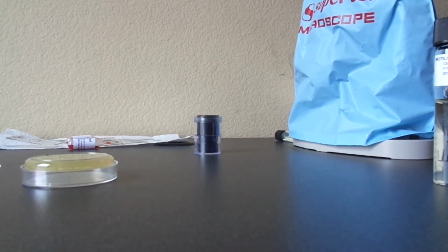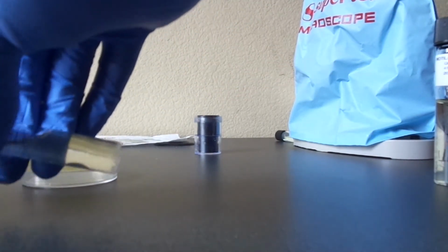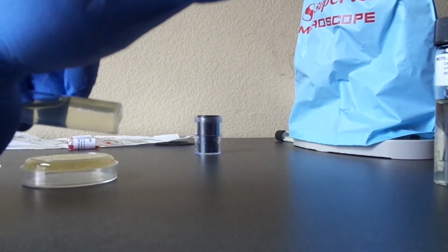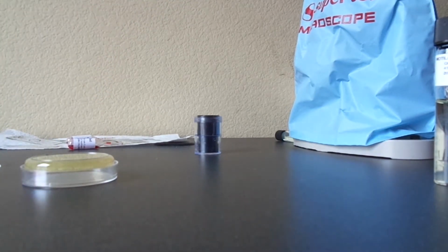Okay, and then I'm going to flame this before we turn the cap. My cultured broth, probably going to have to use it again. And then let's do E. coli on the motility test tubes.